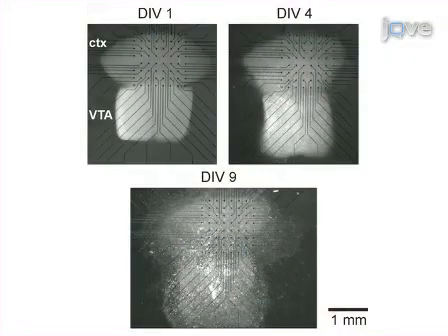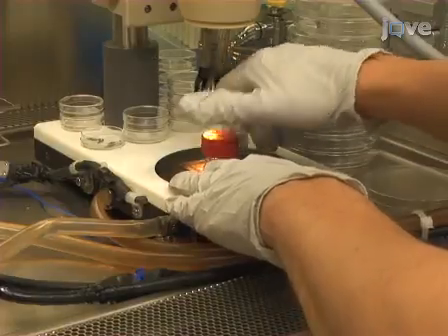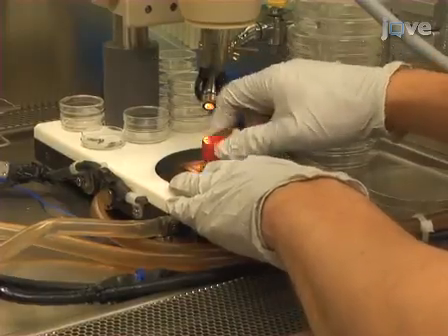Next, gently position the cortex on the array with the dorsal border along the second electrode row of the array. This way, the developing superficial layers will eventually cover the remainder of the array. Then, place the VTA adjacent to the ventral border of the cortex section. Now cap and loosely close the MEA chamber to retain high humidity.